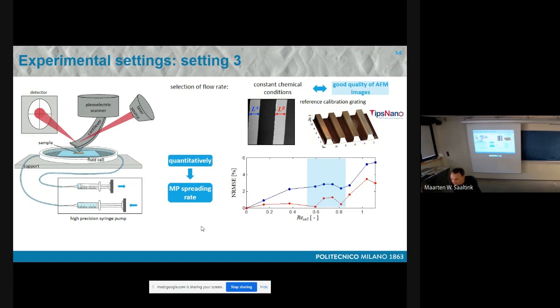What I'm saying is that if the two mechanisms are different, probably the geochemical parameters are then different. I don't know. This is why I am asking you. But I mean, they are linked. So when you look at the interpretation, you have these etch pits, where you have this nucleation of steps, and then you have this step retreat.